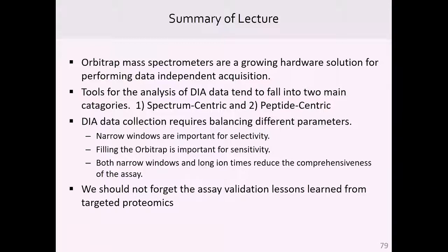I just wanted to point out the fact that people have always thought the bigger the library I get, the better the results I'm going to have, and I don't think that that's necessarily true, and people just have to be cautious with that. Sometimes it may be better to have a sample-specific library. But I'll talk about how we do it specifically on Thursday.